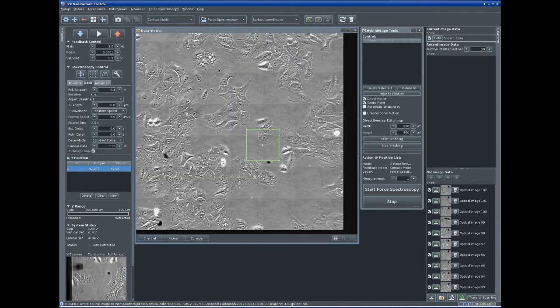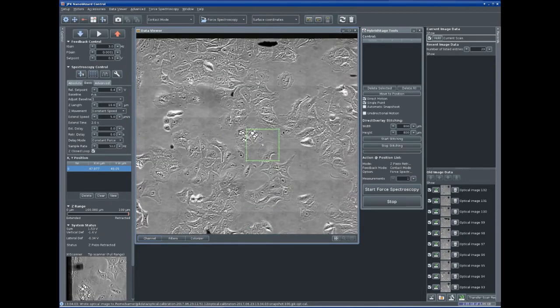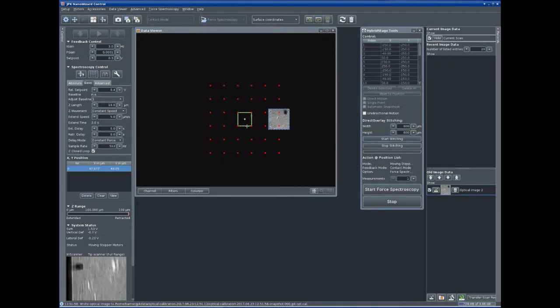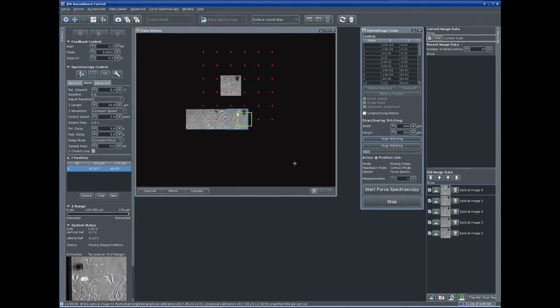It has an increased set range of 100 micrometers and a motorised unit for large sample movements in the millimetre range. Combined with optional scan ranges and the direct overlay optical tiling feature, the hybrid stage provides the flexibility you need to map and perform force measurements over large sample areas.